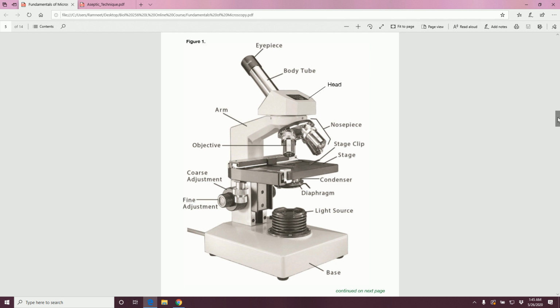So these are the basic parts of the microscope. Okay, so when you are trying to focus some sample, always try 4x first. Okay, because 4x is a scanning lens and you can see more area. Okay, so first focus at 4x and then move from 4 to 10. As the compound light microscope is parfocal, when we change the magnification, the image remains in focus. And then the fine focusing, using a little bit of your fine focusing. So the image stays in focus when we change from 4x to 10x or from 10x to 40x.